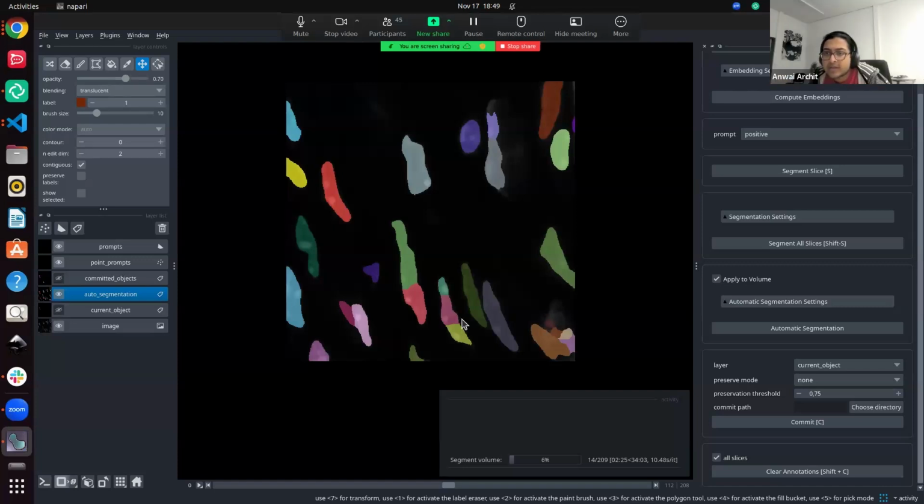Has your model been trained on other types of bright field images than mammalian cells? Bright field of plant cells? Yes. There is this data cohort called plant cell, and we trained on, I think, the entire plant cell cohort for root cells, for ovules, for cilia, and a few other structures. Some were imaged with confocal, some with light sheet, but there was a wide range of it. I hope that answers your question.